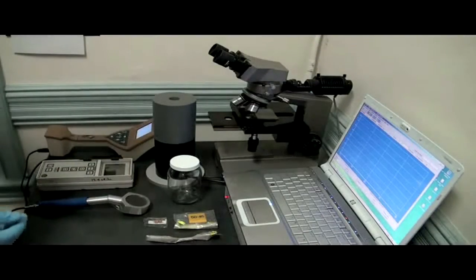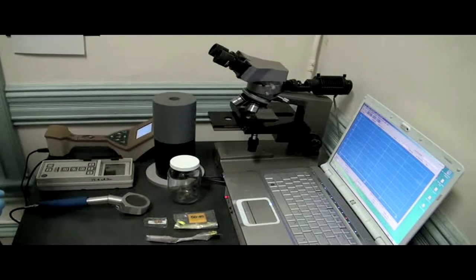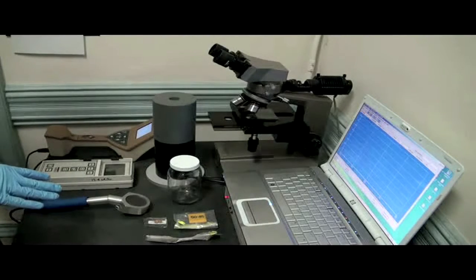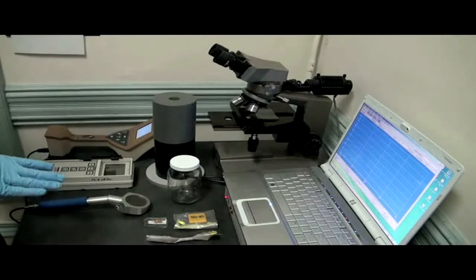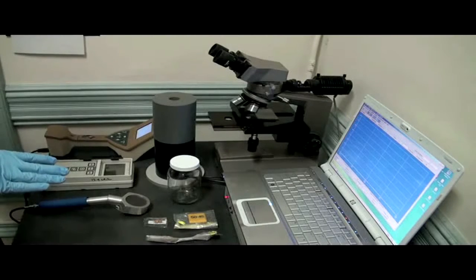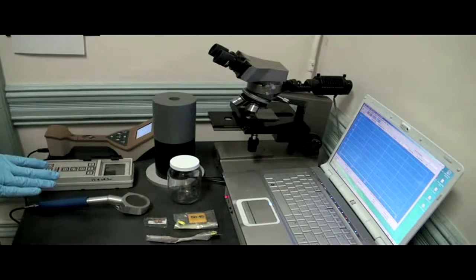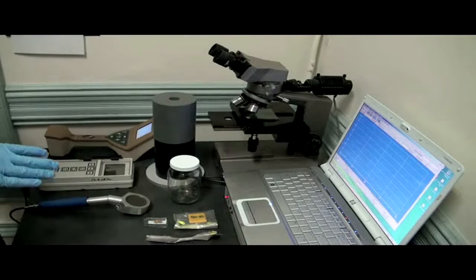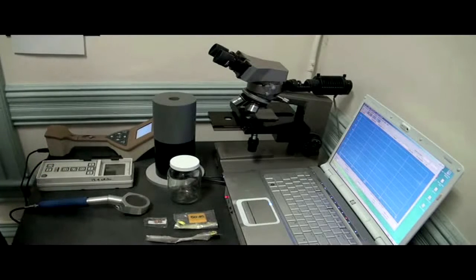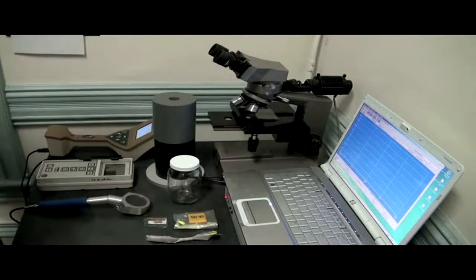Hi, my name is Marco Caltofin, and I'm an engineer, and I also do research at Worcester Polytechnic Institute on radioactivity. This small lab bench is where some of the samples that we collect for radioactive contamination get processed. And I just want to talk about a few simple ways we can improve on the way we sample and test as citizens and get some better data to tell us more about radiation in our environment.